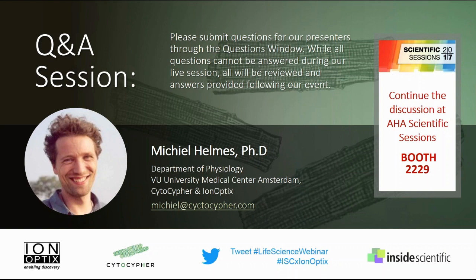So next question. What are some of the ways that we can address the variability we see in both data acquisition and analysis? Michael, you spoke a bit about this, but maybe you can cycle back. There are a couple of sources of variation after you take out the cell isolation itself. One important one is environmental control. One of the weaknesses of the existing IonOptix system is that you have to use perfusion to keep the temperature constant, and it's hard to keep it really constant. If you don't pay attention, your temperature will differ, which will greatly affect the kinetics of your data.